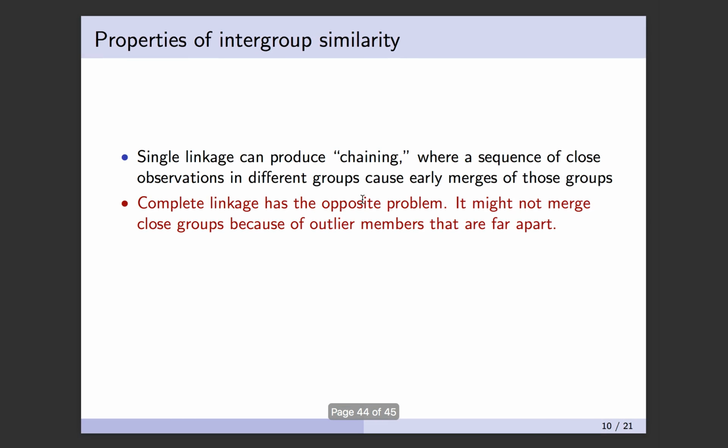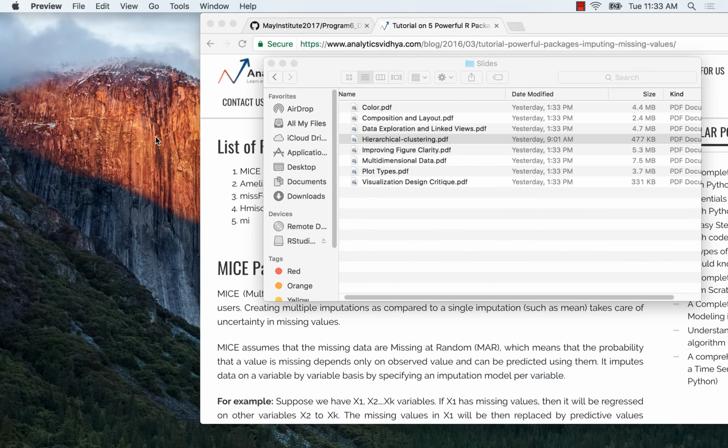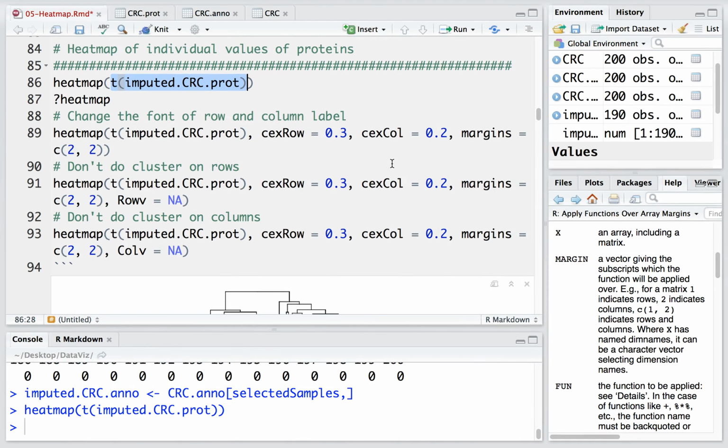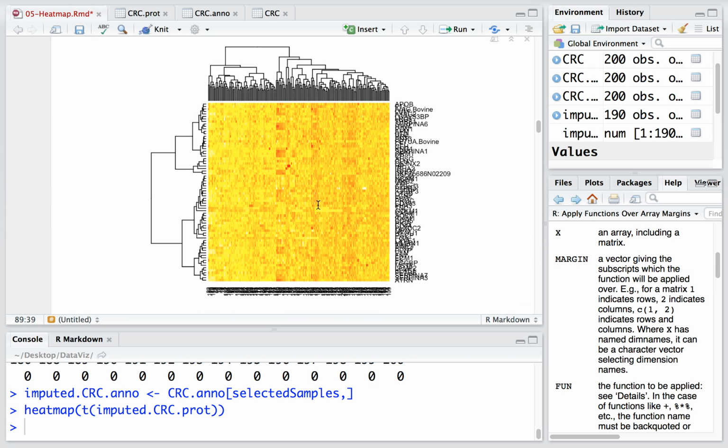Okay, I think that's all the points I'd like you to know before we do the hands-on. Before we try some real analysis, let's look at some options. For the heat map here, the X labels are quite messy, and we almost see nothing from them.